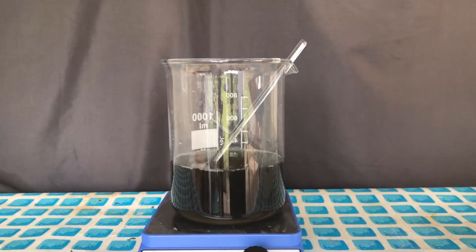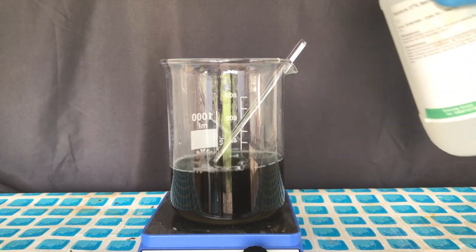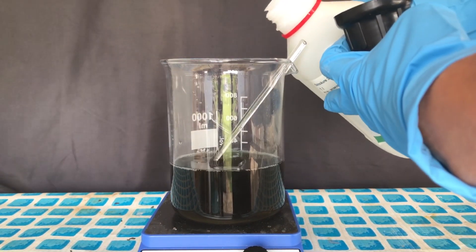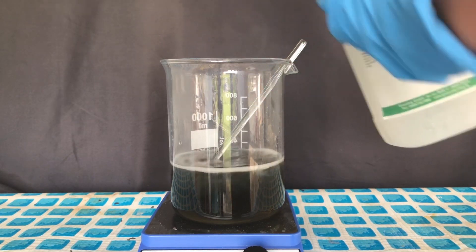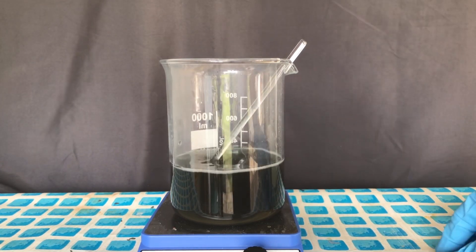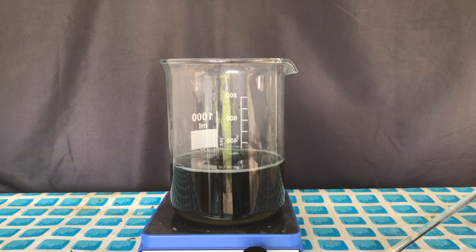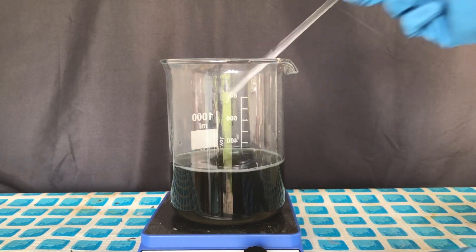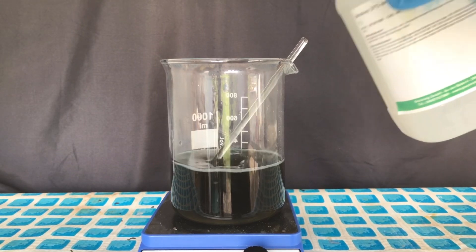Next, we are going to add hydrochloric acid. This should form silicic acid and later on silicon dioxide. I'm not going to use any specific amount of hydrochloric acid because I don't know how much disodium silicate is in solution. I normally wanted to add hydrochloric acid until the pH was neutral, but I ended up not doing that and only added hydrochloric acid until something interesting happened.